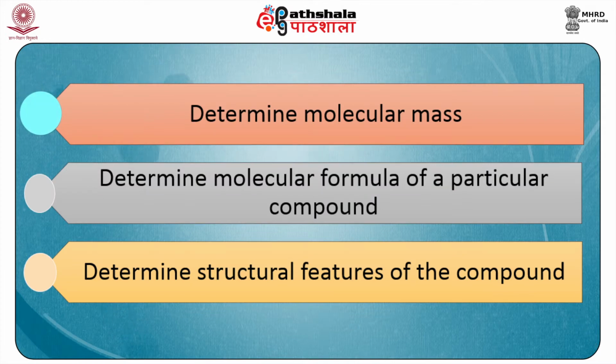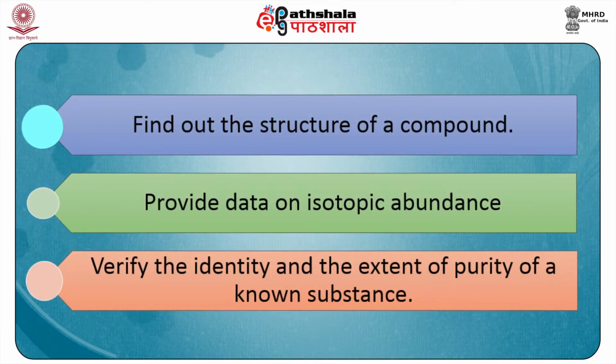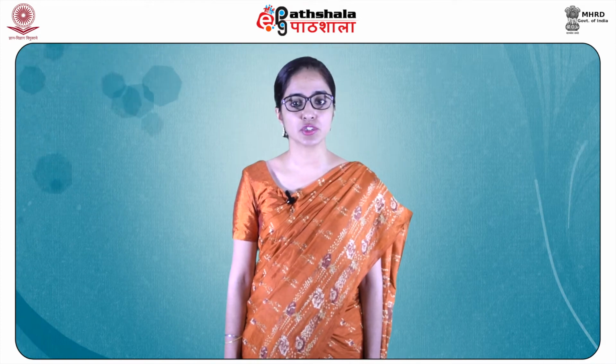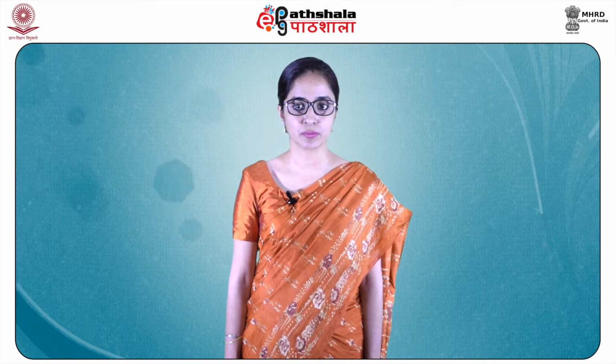Mass spectrometry is used to determine the molecular mass and molecular formula of a particular compound. It is also used to determine structural features of many compounds, to find out the structure of a compound, to provide data on isotopic abundance, and to verify the identity and extent of purity of a known substance. Mass spectrometry is an instrumental technique that does not involve electromagnetic radiation.